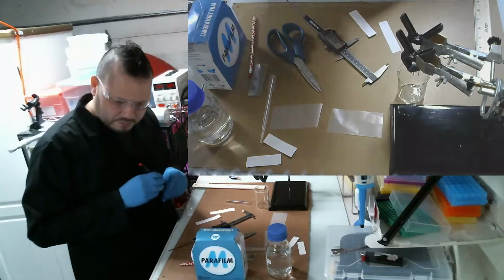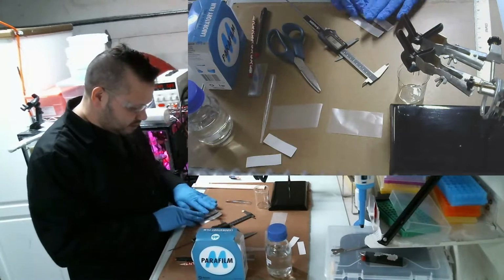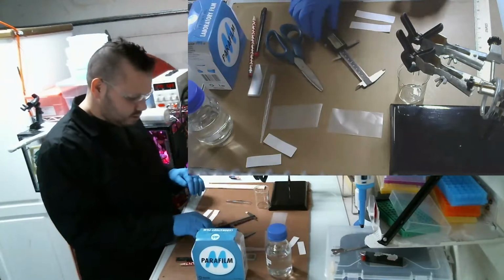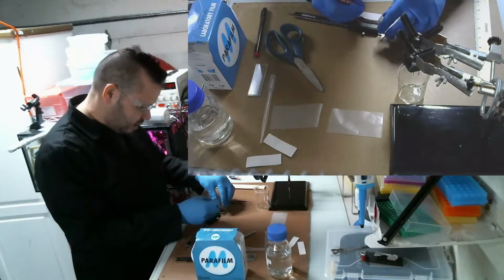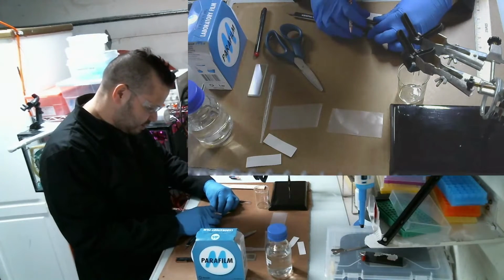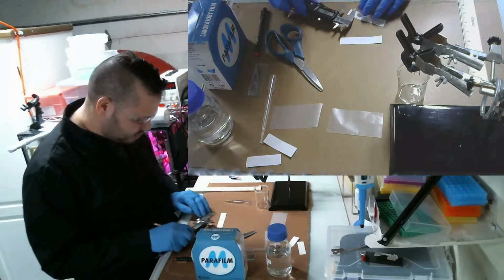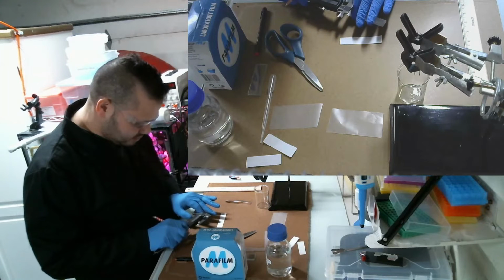Okay, I'm going to check what steps I'm doing here. Now I need to use a pencil to mark a 20 millimeter line. Now I need to mark essentially a 2 centimeter line, and then on the other side I need to do a 1 centimeter line.